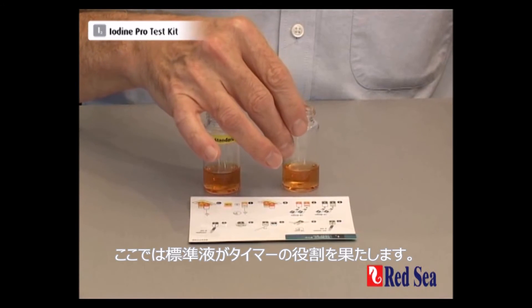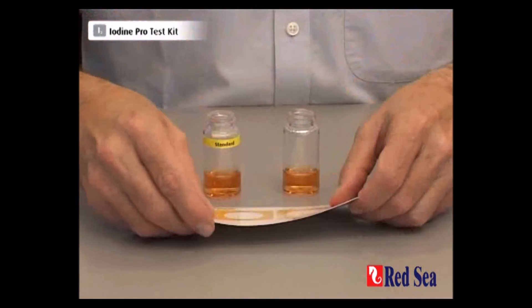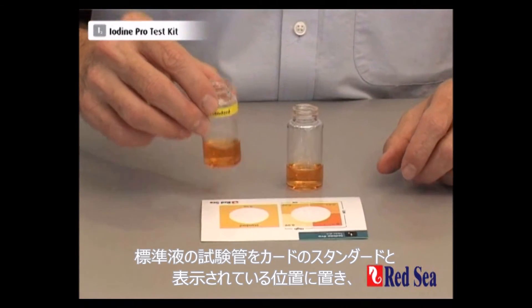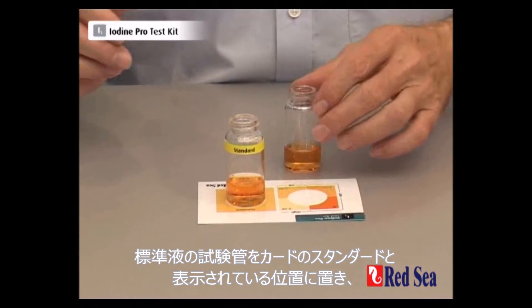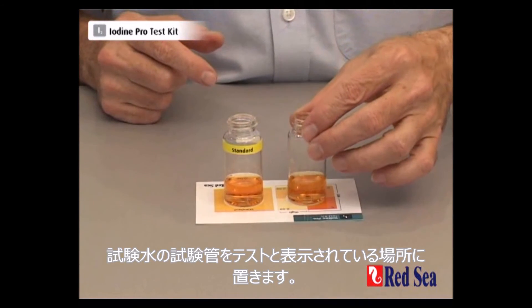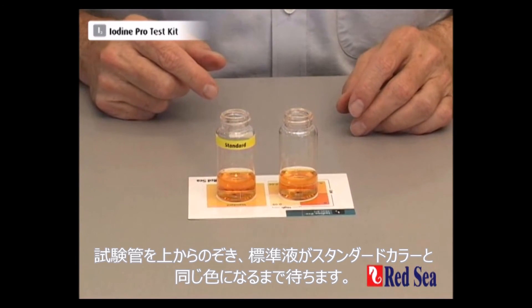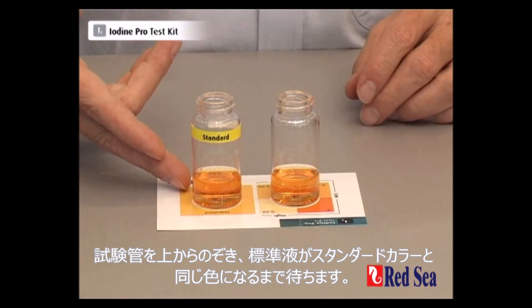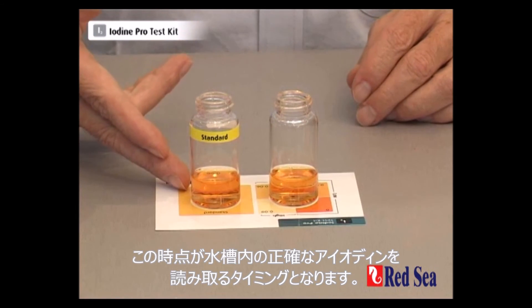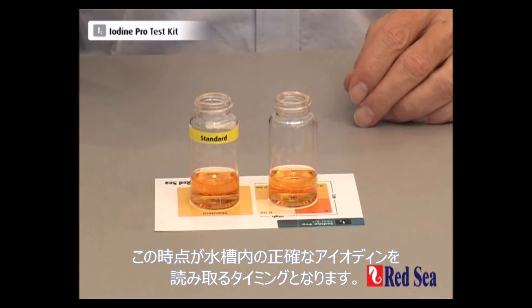Now in this test the standard solution acts as a timer. We're going to place the standard vial on the card where it's marked standard and the test vial in the position on the card. We look from above and wait until the color in the standard vial matches the standard color, at which point we can read off the exact level of iodine we have in the aquarium.